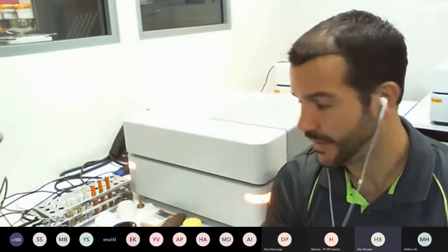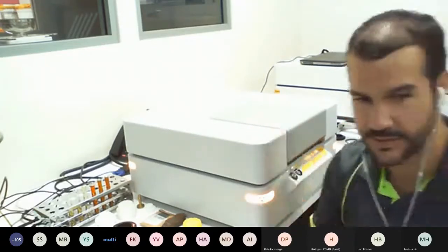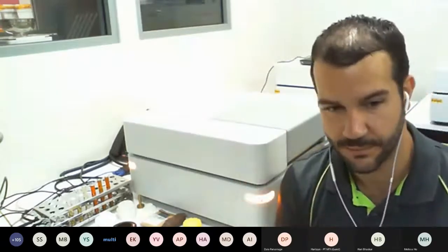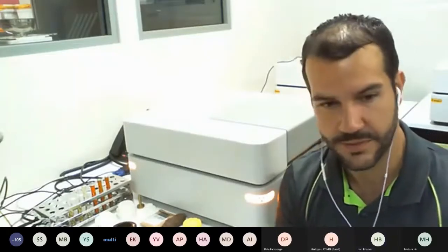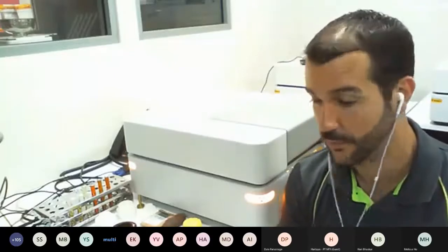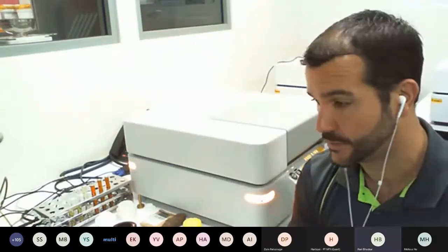Hi, everyone. So I'm here in the Perth Applications Laboratory with our Epsilon 4 unit. I've got it next to me. You see it's nice and compact. It's sitting on the bench top, doesn't take up a lot of space. It plugs into 240-volt power, so you don't need a dedicated power source. It's handy to have an uninterrupted power supply for it, but obviously you can have a battery that can keep it running for a longer time because of the much smaller draw that the instrument takes.